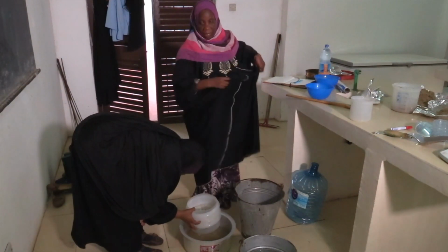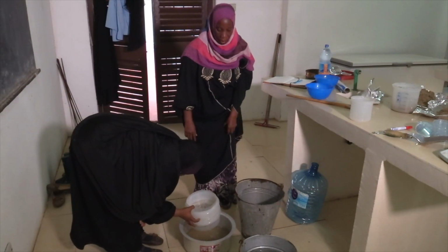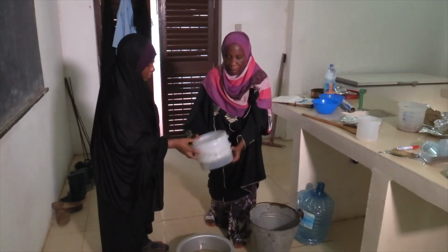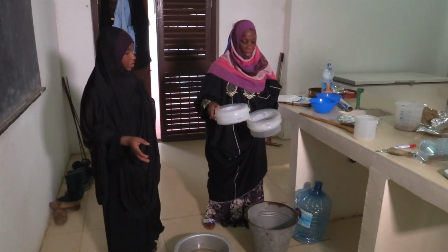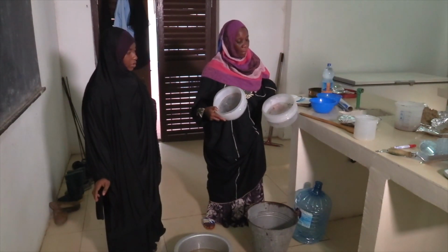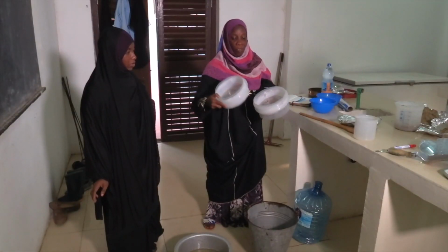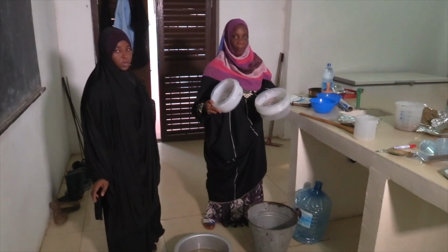We use this procedure at least 2 times because maybe there are some particles that are not separated. Now, as you see, there are some particles in both size ratios. This is the residue greater than 1 millimeter, and this one greater than 0.3 millimeter. From this, we can count the microplastic.